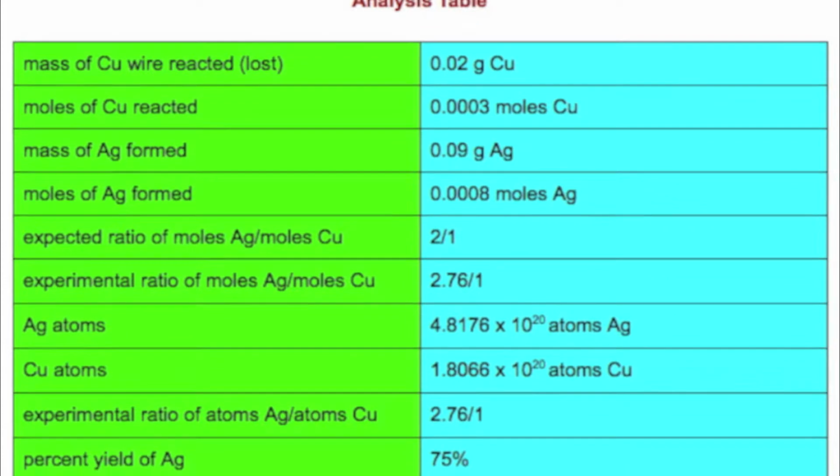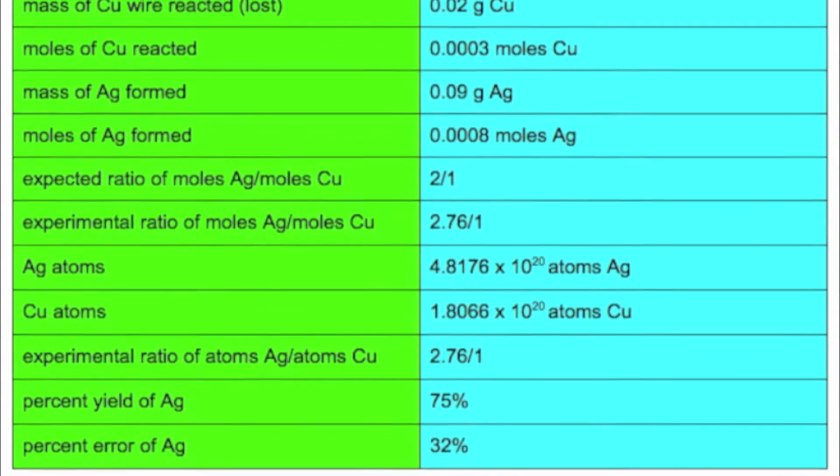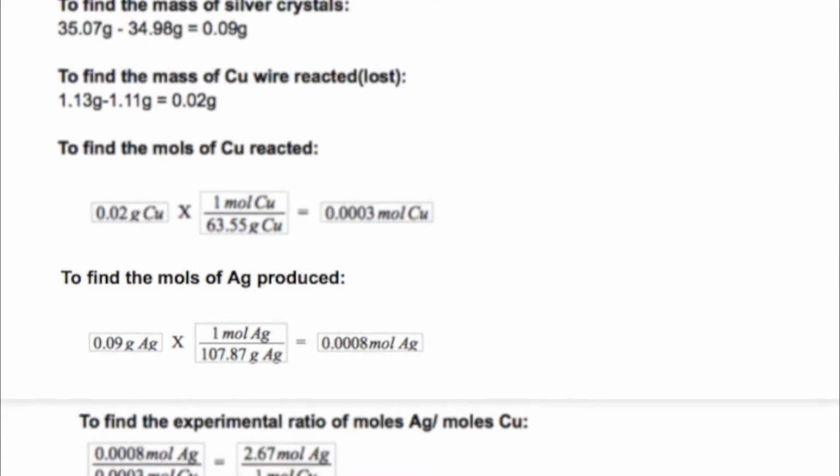The analysis table is as follows. The calculations are as follows.